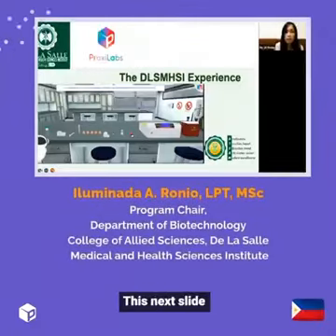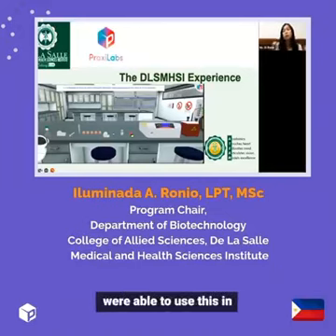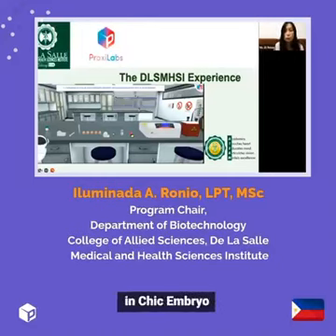Now, this next slide is the actual virtual laboratory for the cultivation of virus in chick embryo. My students and I were able to use this in our developmental biology laboratory. So we were able to inject the virus, or it could be bacteria or any microorganism, for us to observe whether the chick embryo will develop or not develop. So there. And it's really nice and fun to use.